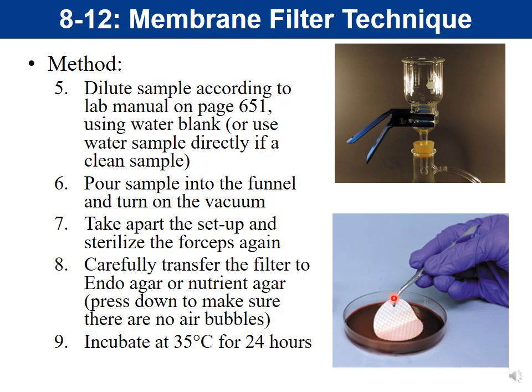on your endo agar. Now, endo agar is light sensitive. So when you're working with the endo agar, in between, you would want to store your endo agar in your drawer until you are ready to use it. You would not want to leave this sitting out on your desk because if it's light sensitive, it might affect the results. So we keep them stored in our desk drawer until it's time to do the experiment.